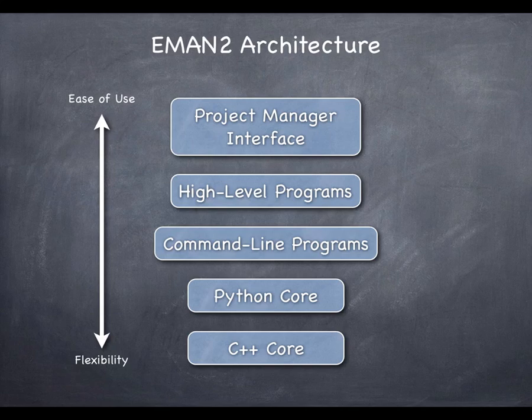Now, this is sort of an overview of the package. I'm not going to talk about how to do cryo-EM reconstructions today or something like that. This is still a programming class, so we're going to focus mostly on the programming side of things. But still, it's good to understand the architecture of the package.